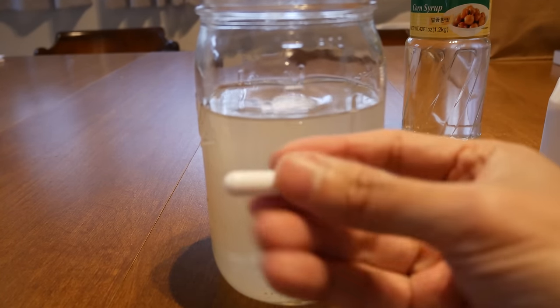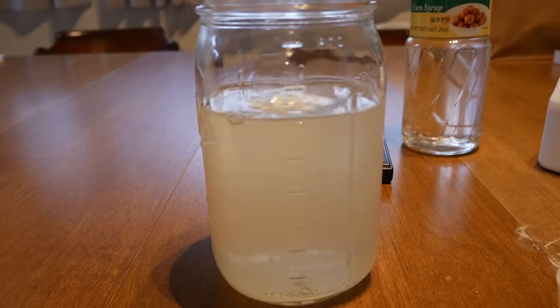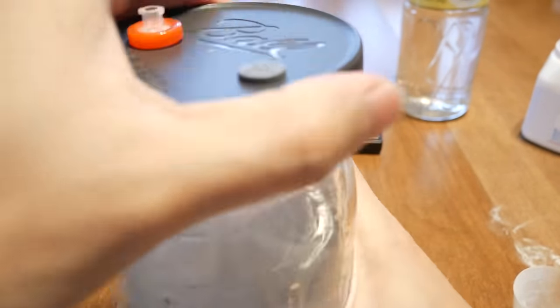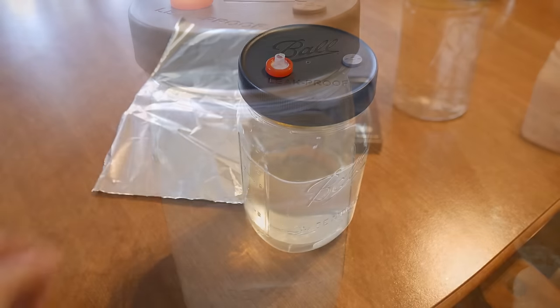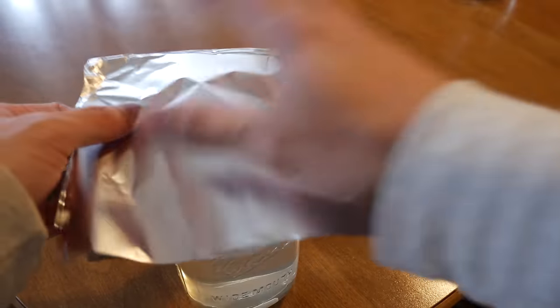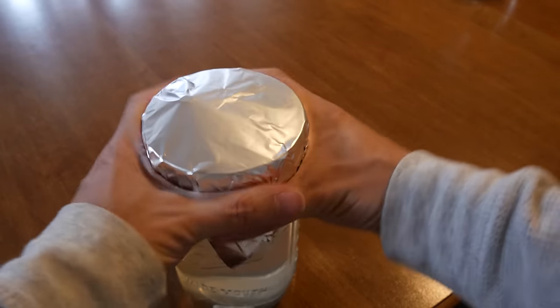Now we're going to drop in our magnetic stir bar, put on the liquid culture lid, and screw it on tightly. Then I'm going to wrap the lid with some aluminum foil to protect the syringe filter during the pressure cooking process.